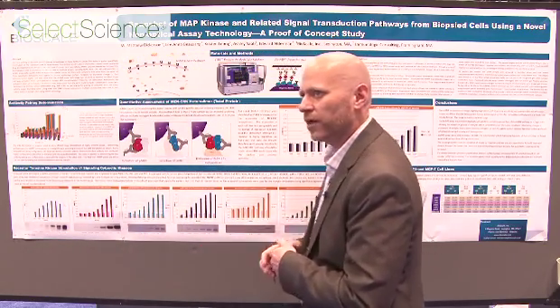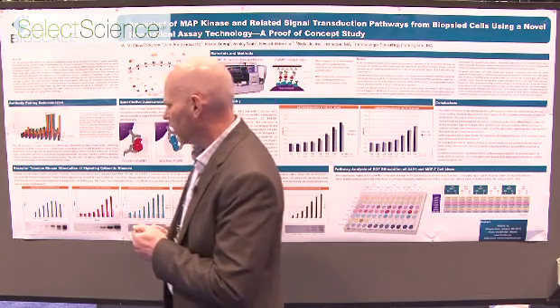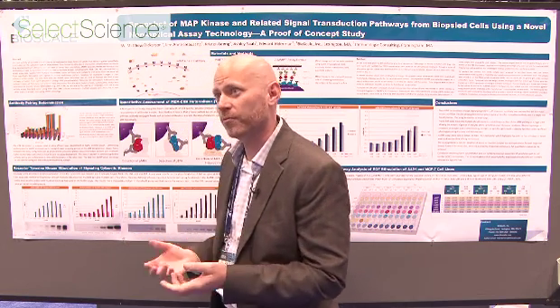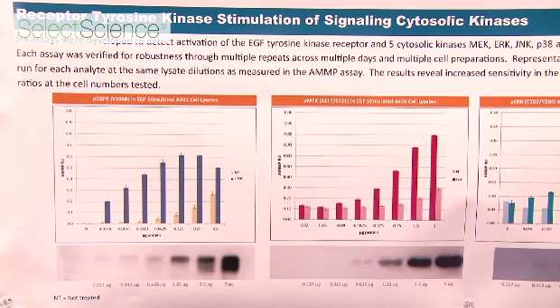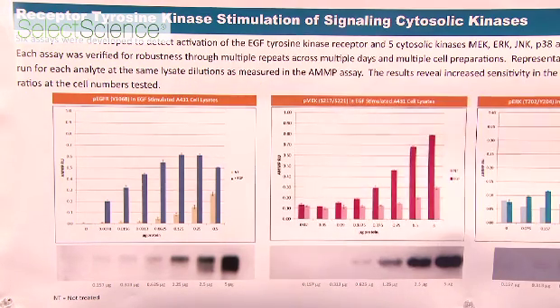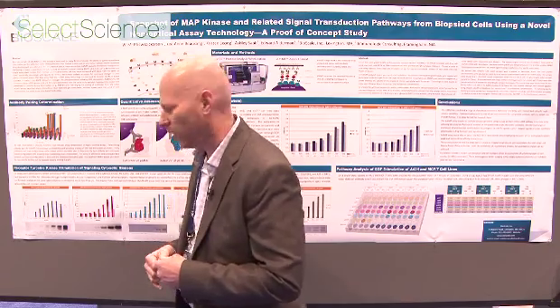These are several different assays that we've developed against kinase markers. Let's look first at the phosphorylation of the EGFR receptor. Standardly, people doing this kind of analysis would run a Western blot. So the Western blot is illustrated here. In a Western blot, you load a certain amount of protein, you blot it against your antibody, and see your band. So that's what's here. We started with 5 micrograms of protein, you dilute it down, and we're trying to compare our sensitivity in this graph to the sensitivity of the Western blot.